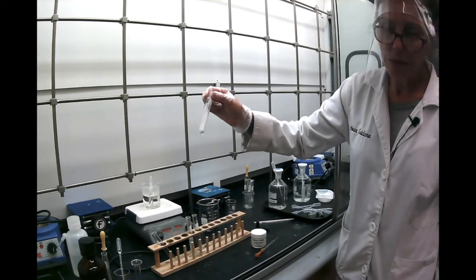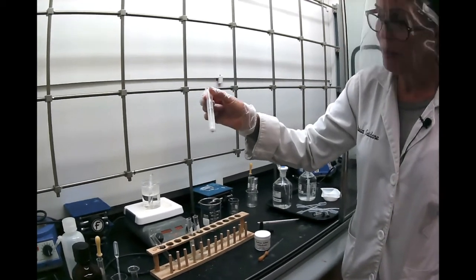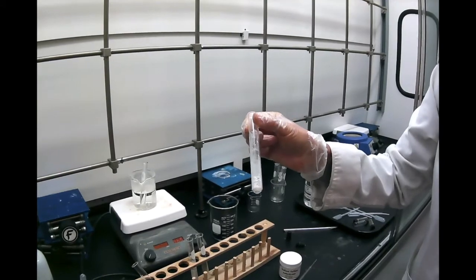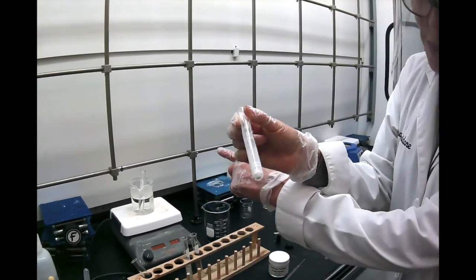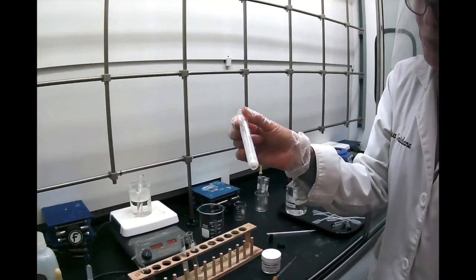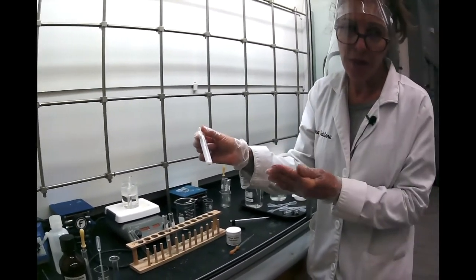It's done. So we can now measure here how much benzoic acid is in the passive extraction, and then while we wait for the active extraction to produce the benzoic acid. So my last step is to go and weigh it, so I'm ready for my calculation.